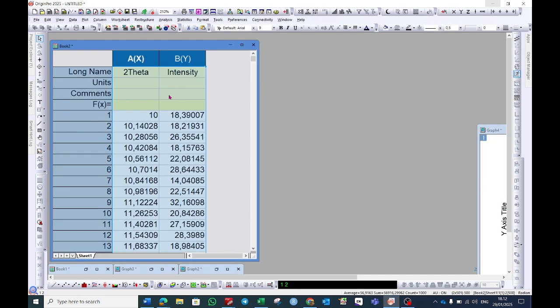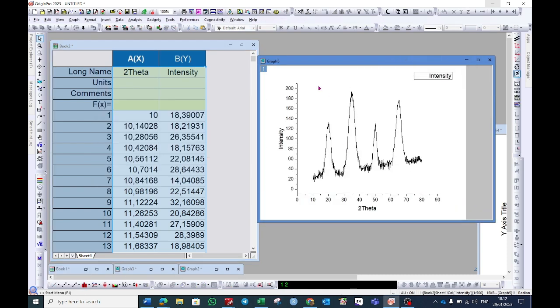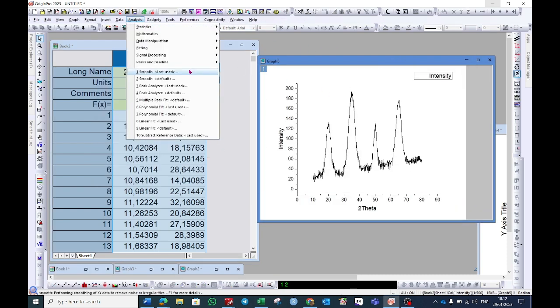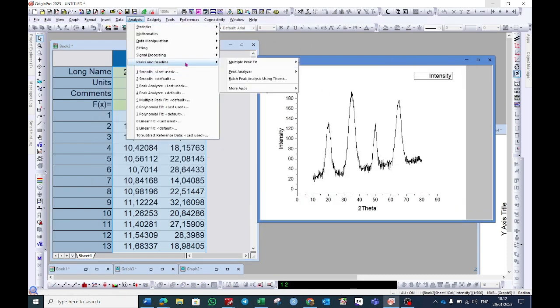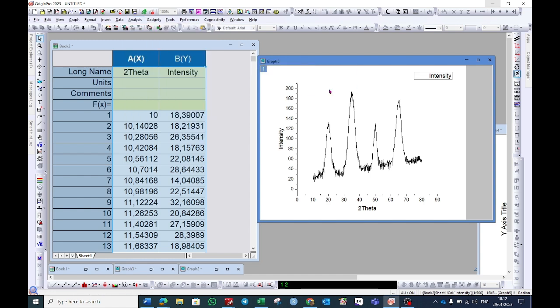Create a graph. After doing this, now go to the analysis option. Choose peak and baseline, and then peak analyzer. Click on open dialog.